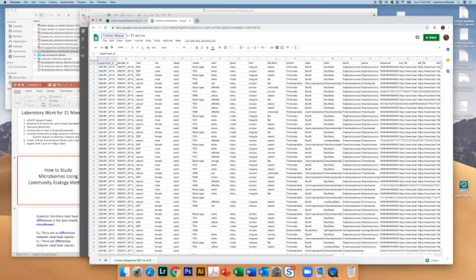sequence black-eyed pea versus Adzuki, since that's the nature of the file we have. Of course, you can give it any name you want. And the tab, I would double click on it and call it raw data. And just click out of that.